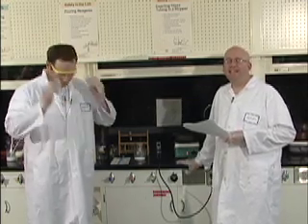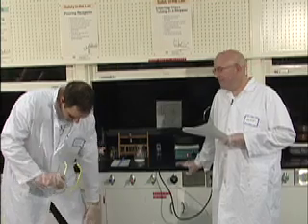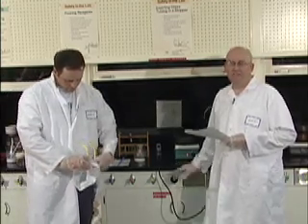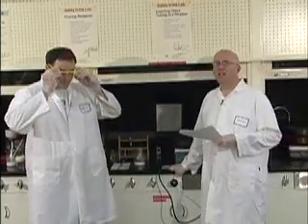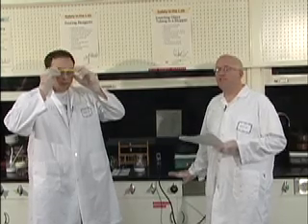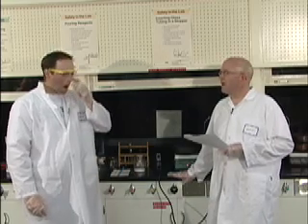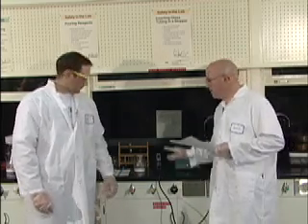So we're making acetylsalicylic acid today. Scott, our expert, is going to lead us through. We also had Sherry, who isn't here. Did she help make some of this stuff? Sure. Sherry wanted us to call her the official chemistry lab video stylist, so I wanted to make sure we got that on tape. Perfect. Okay, so tell us where we get started.